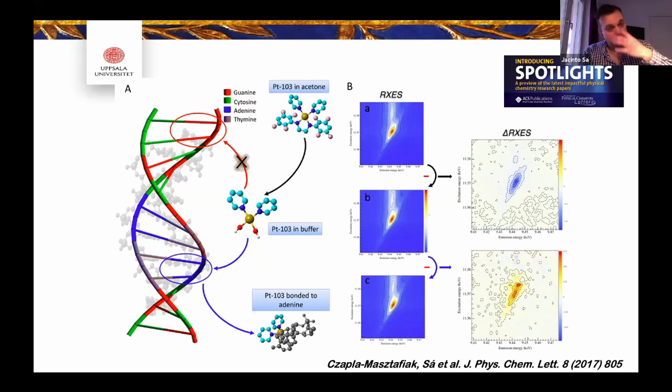Yeah, I mean, we're going to try to run this at MAX IV to see if, when they have the Johansson commissioned. I mean, we didn't have it. We were discussing with Matthias to try to get this spectrometer from SRF, but then at the time I moved to Sweden and Jakob moved back to Poland, so it became a little bit difficult to do this. But you have a point there. I think this kind of drug in the end turned out to be actually quite a well-behaved drug. We are working now with other ones, where of course the Johansson would help us a little bit.